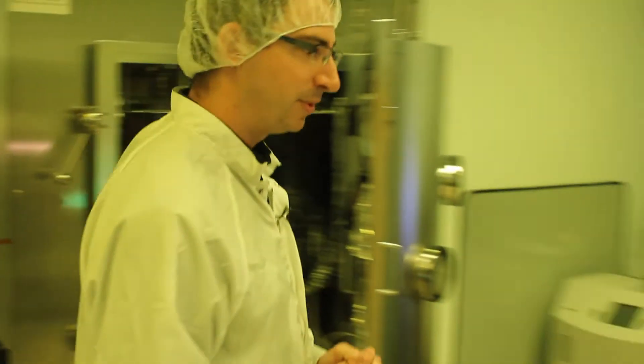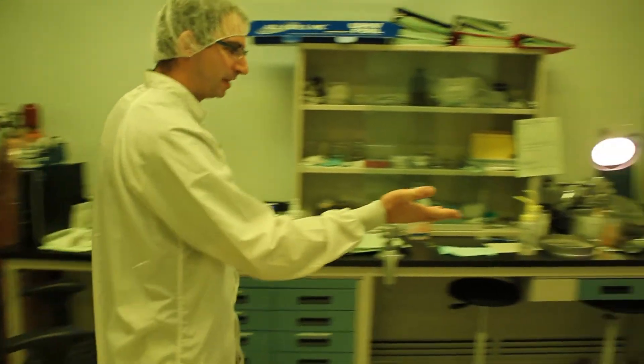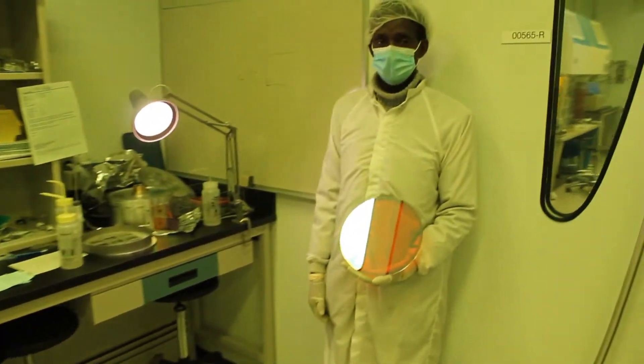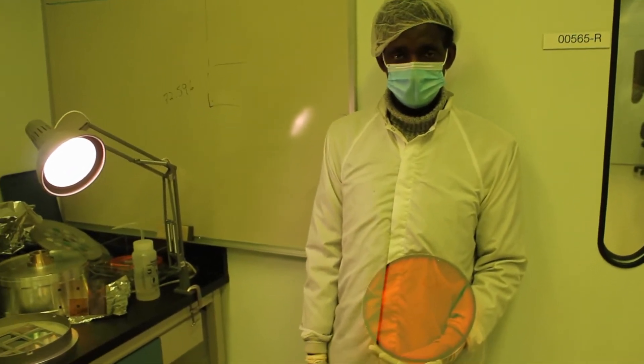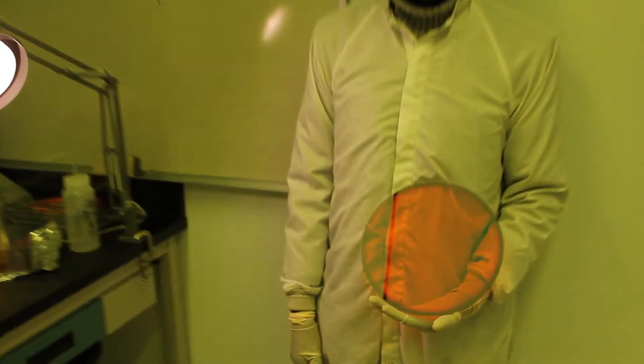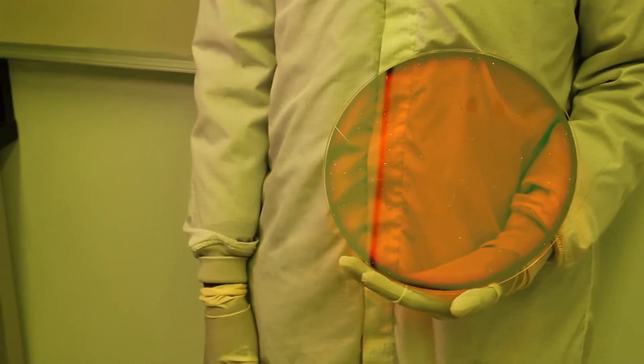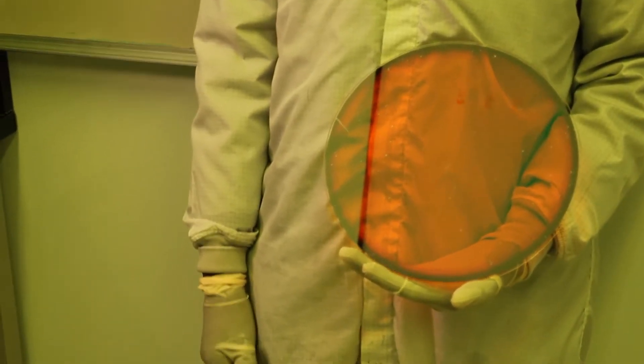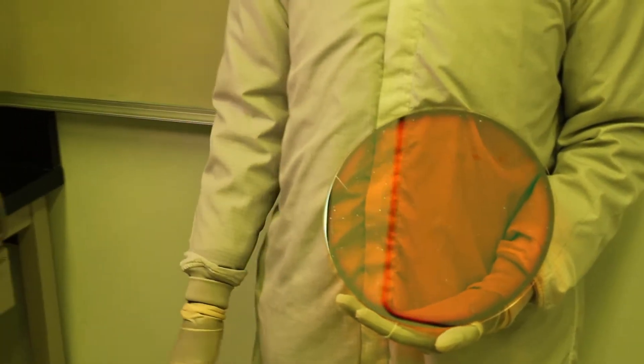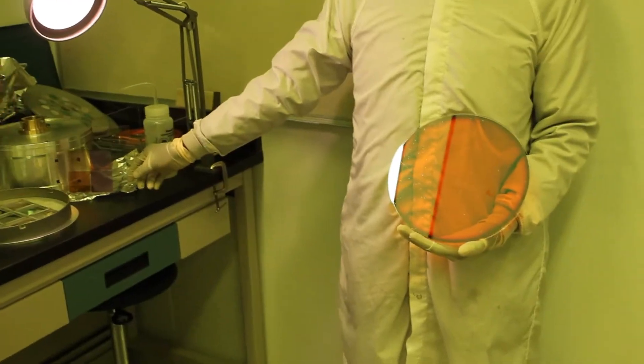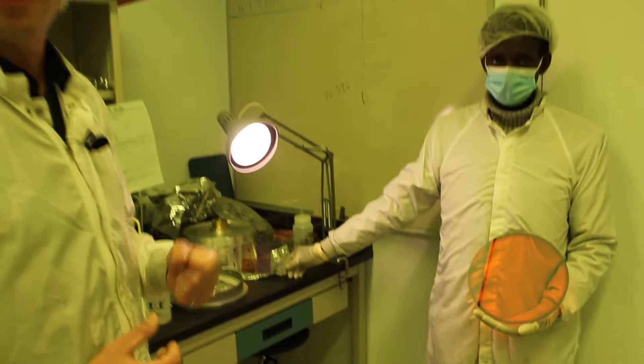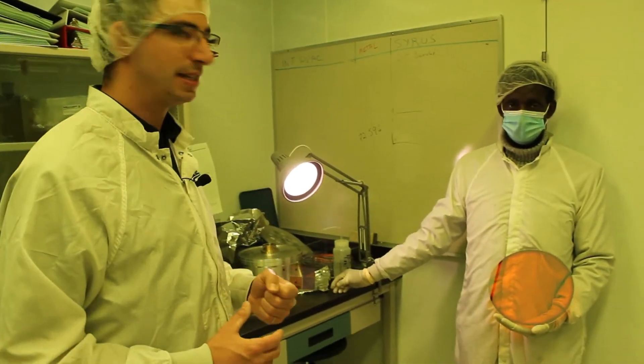Let's move on to a few examples of what we can fabricate here. Here, Suleiman, our research associate who is running these thin film facilities, is holding a 9 inch diameter wafer with a dielectric mirror centered at 1064 nanometers. The mirror is composed of 24 alternate layers of niobium oxide and silicon dioxide.